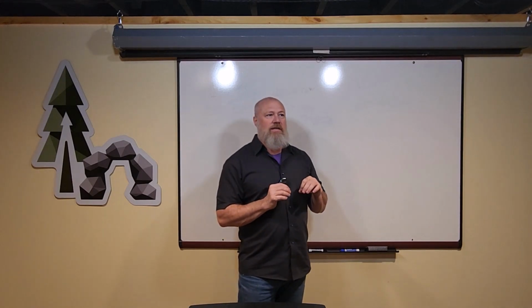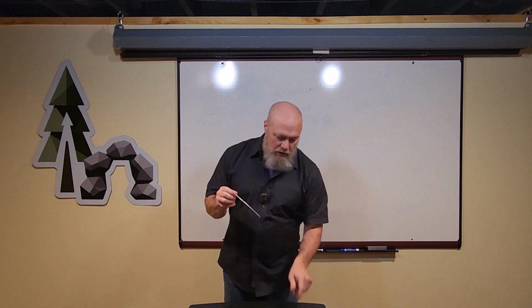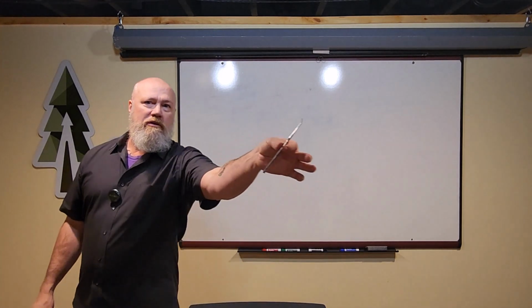Now the tools you're going to use. Most of your dissection, especially in my lab, I would like done with blunt dissection. Blunt dissection means you're going to use mainly your fingers, mainly your fingers and hands. You can also make good use of the blunt probe. And then, I don't know how to show these things up close.